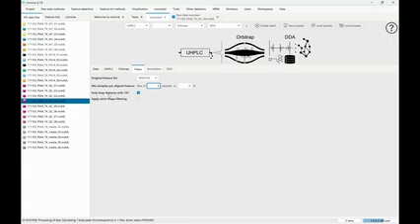And only keep features with 13C. We're going to check it for now. So we check this feature. It's basically going to evaluate the 13C isotope pattern of our features. I'm going to say this one looks like it could be something real, something of natural occurrence. If you do isotope labeling, of course, you would have to uncheck this and you would have to process a bit differently.